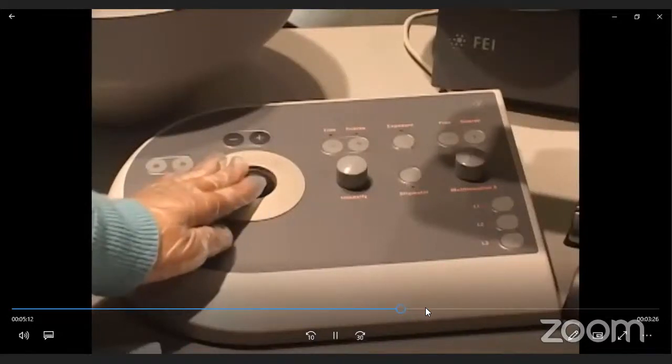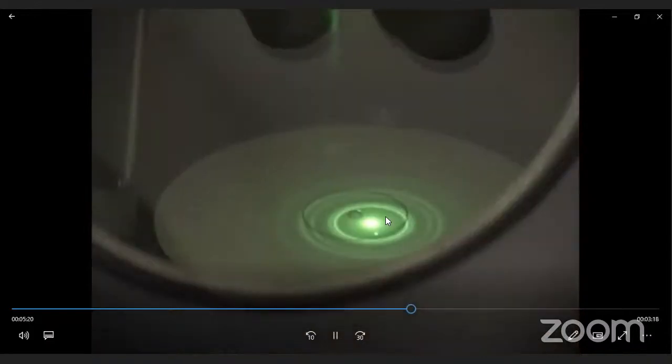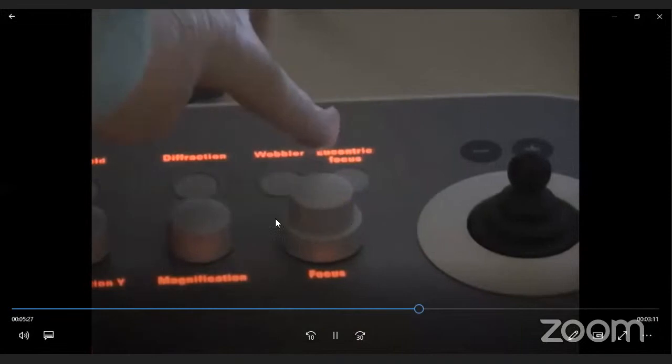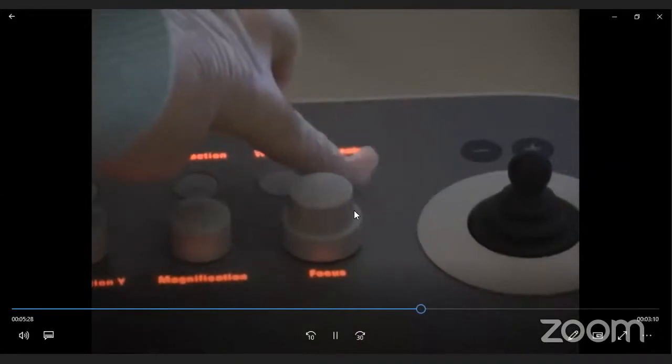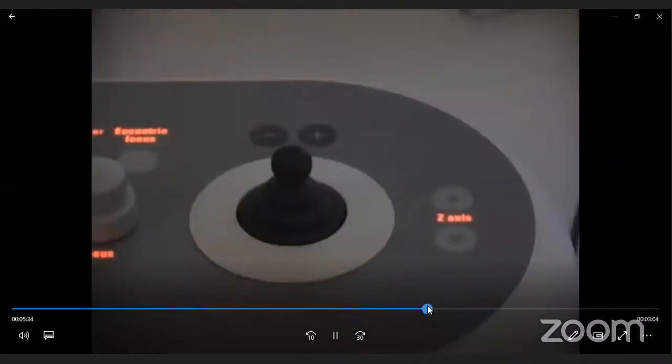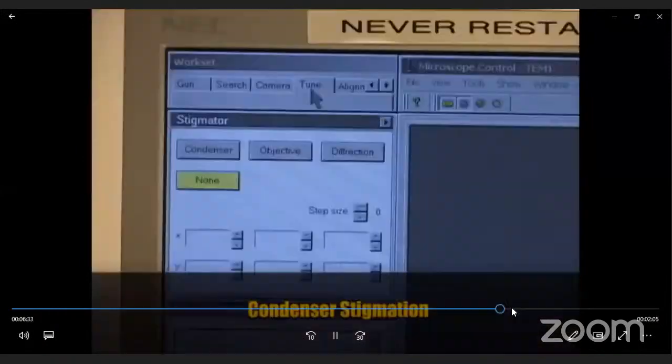Okay, so this is a kind of diffraction pattern, and we have to focus these. Various controls are there to form the images. In fact, we can clearly see the image over here also, but for better visibility, we have to transport this into the machine itself. So let's skip this section.